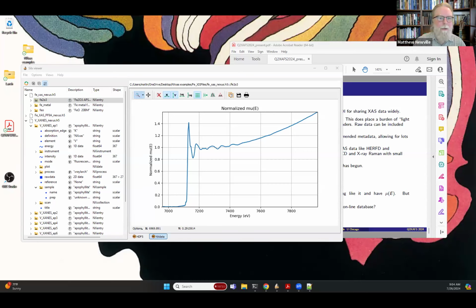I think maybe some of your beamlines, but my beamline, we collect X-ray fluorescence maps where we collect a map that's 1,000 by 1,000 pixels, maybe not today. Someday soon, we'll be doing this again. 1,000 by 1,000 pixels and 7-element detector, 4096 energy points. We're saving all of that data into a file, and we collect those at 3 millisecond dwell times.